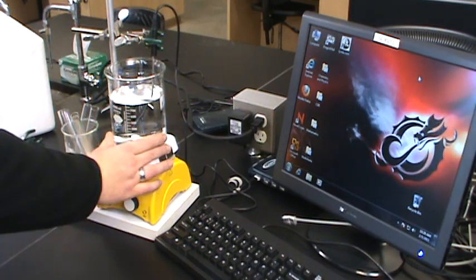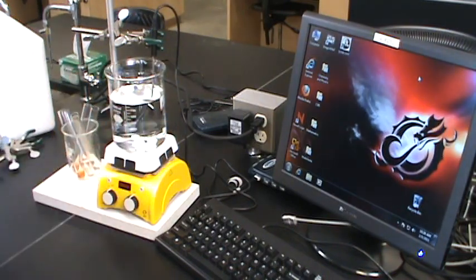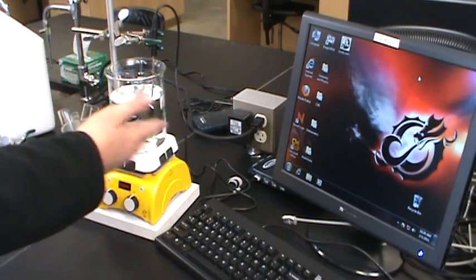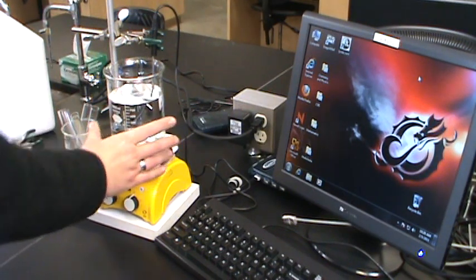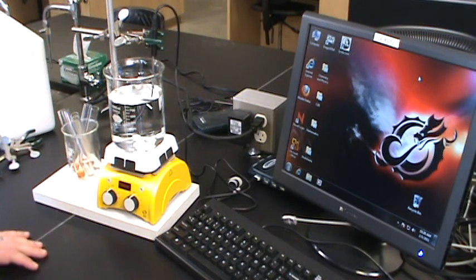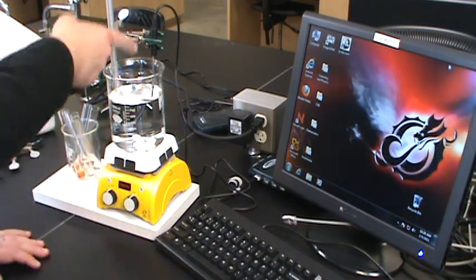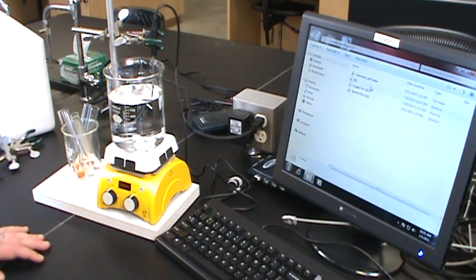So the cool bath is going to be in a large beaker. Not sure exactly what size they're going to be, probably 800 milliliters, 1,000 milliliters, something like that, with water in them. So the thing we need to do is monitor the temperature of that. So you see I've got my temperature probe clamped into position. So let's go ahead and open up Logger Pro.